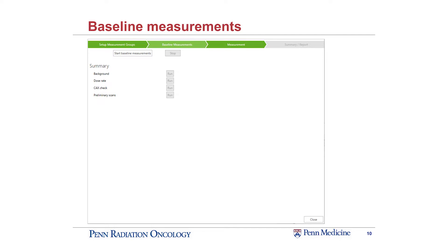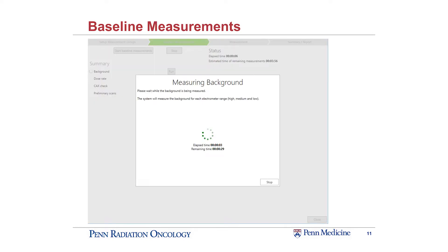This is what will pop up when you invoke the SmartScan software. We've already gone through the setup of the measurement groups, and now we're going to do the baseline measurements. This is really nice because once you start these baseline measurements, it keeps track of everything that's been done and organizes and lets you know what you still need to do. When you hit start baseline measurements, it'll start taking your background measurements, and this box will pop up. It will let you know an estimated time it needs to take the background, and then once the background measurement is done, it'll move on to dose rate preparation.